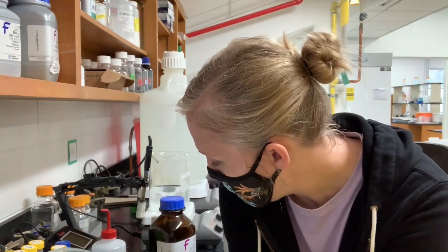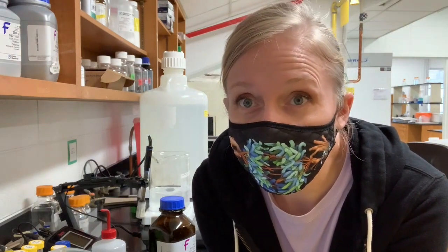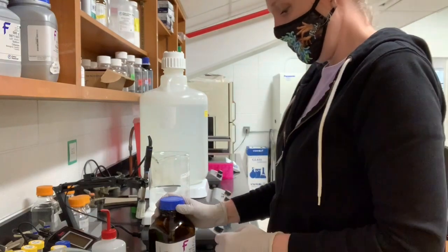If one time you use 80.06 grams and the next time you use 81 and the next time you use 79.5, then every solution you make will be very slightly different. And if you have slightly different results, then we don't really know why, because we think every one of those batches you've made is 10x PBS.